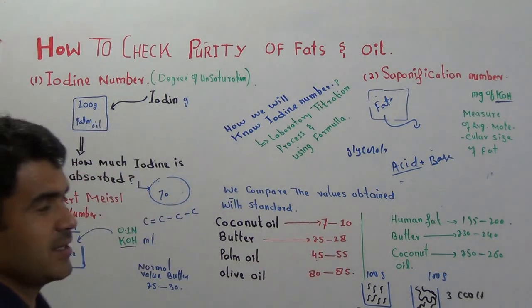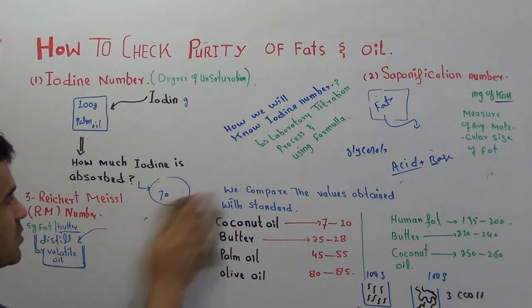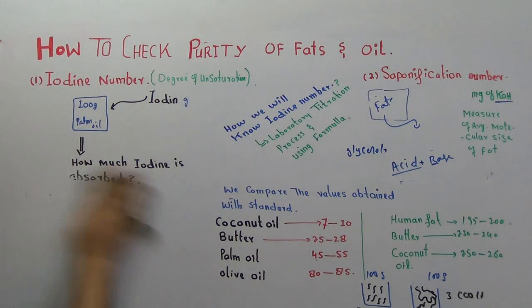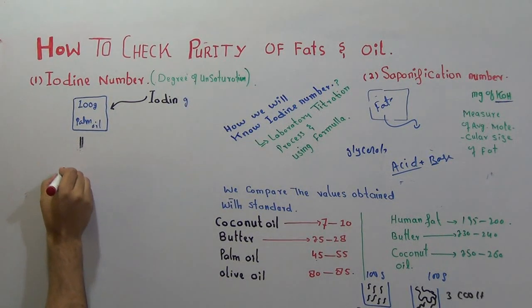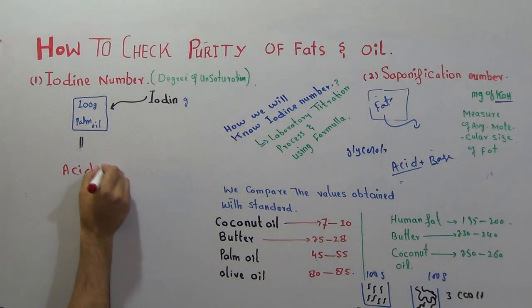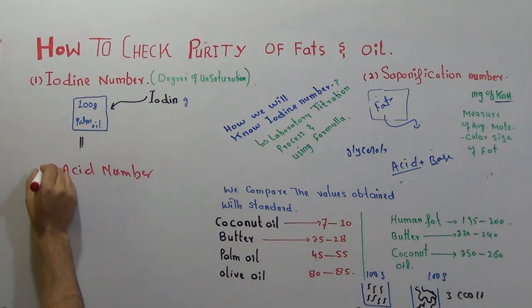Now the last test is the acid number. This is the fourth test.